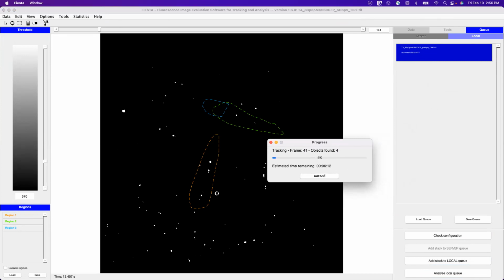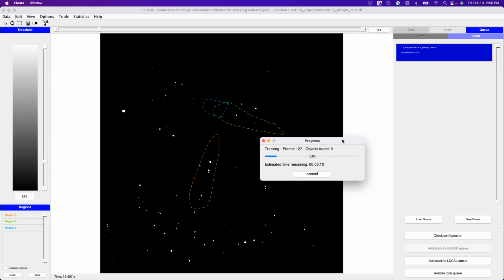For our cell 7 stuff, it's on average probably 5 hours to do one movie. With microtubules, you can select the microtubules because you know where they are. For cellulose, it's going to be the entire area of cellulose, so it's basically trying to do the entire frame, and you'll have like 1,000 molecules per frame.